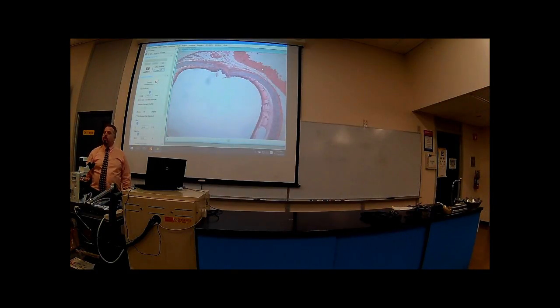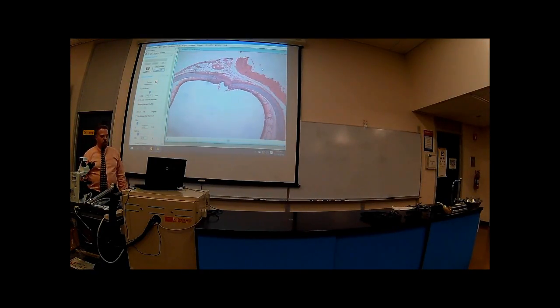What organ or structure are we in? Right, the trachea. Okay, so that's the trachea. So these are some typical questions that I might ask. All right, what is that? Lumen. Okay, what is this over here? If I get up closer, hyaline cartilage. Okay. What organ are we in? Trachea. What's the epithelium that you would find in the trachea? Pseudostratified epithelium. Okay?